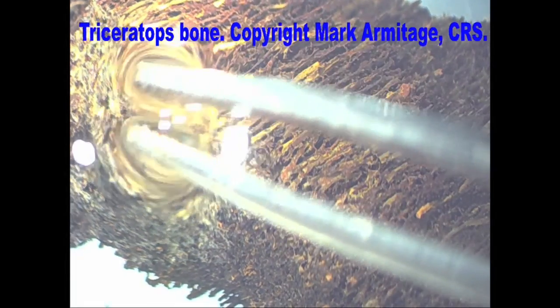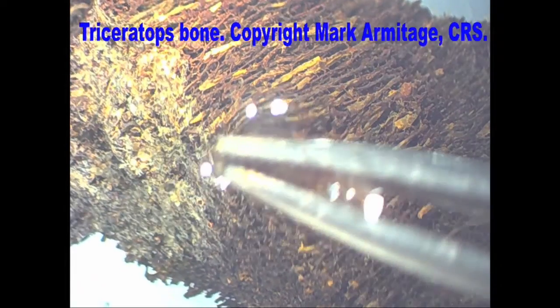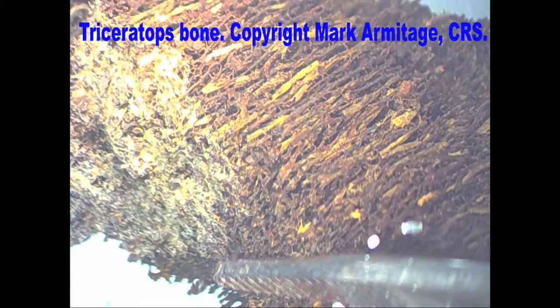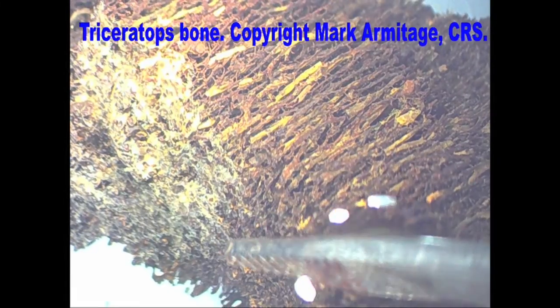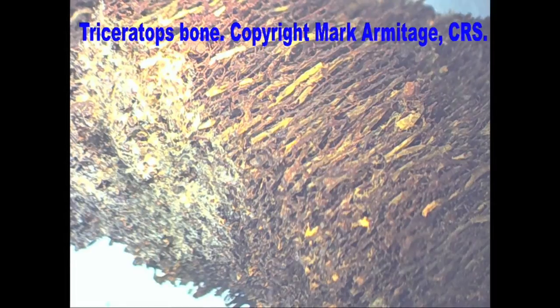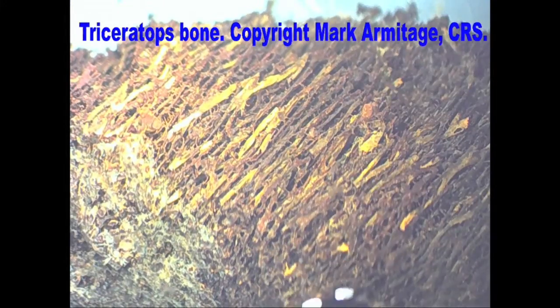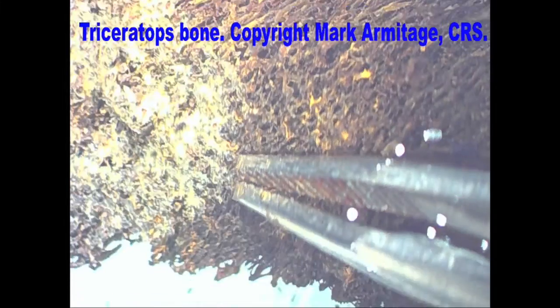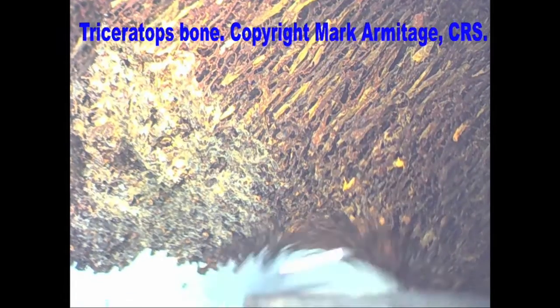Here is a piece of triceratops bone that has been decalcified — all the bone minerals have been removed. You can see how many of the blood vessels are here. This white area is soft tissue on top of these blood vessels. The bone is very stiff because it's fossilized, but there's soft tissue in here. This is about 40 power under the dissecting microscope. As I move this, you can see these soft tissues waving back and forth in the liquid. This is impossible if these bones are 65 million years old — this would all be gone. The matrix of blood vessels has been permineralized and is hard rock, yet these white areas show all the soft tissue still present after decalcification. This is an indication that these bones are very young and not even 20,000 years old — probably much younger than that.